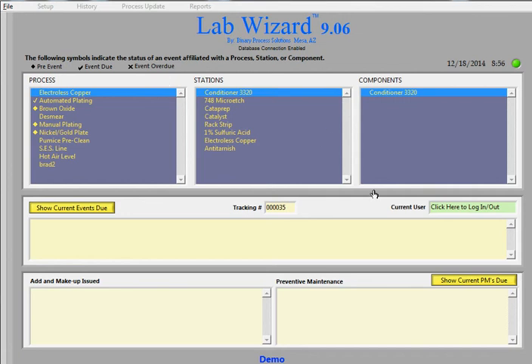So the first part of this demo will be going over the basic screens in LabWizard and what it offers. There will be other demonstrations with more detail.